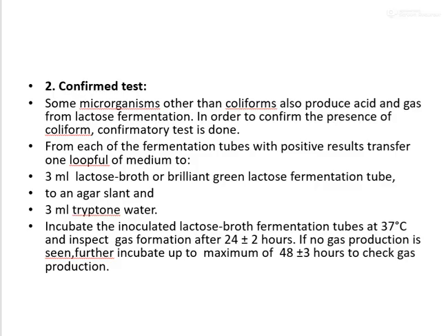Now, once you see the presumptive test, after that we can go to the confirmed test. Some organisms other than the coliforms also will produce acid and gas from lactose fermentation.